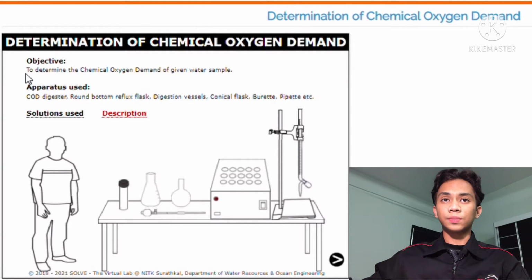This is the determination of chemical oxygen demand, or COD, experiment simulation. The objective of this experiment is to determine the chemical oxygen demand of a given water sample.